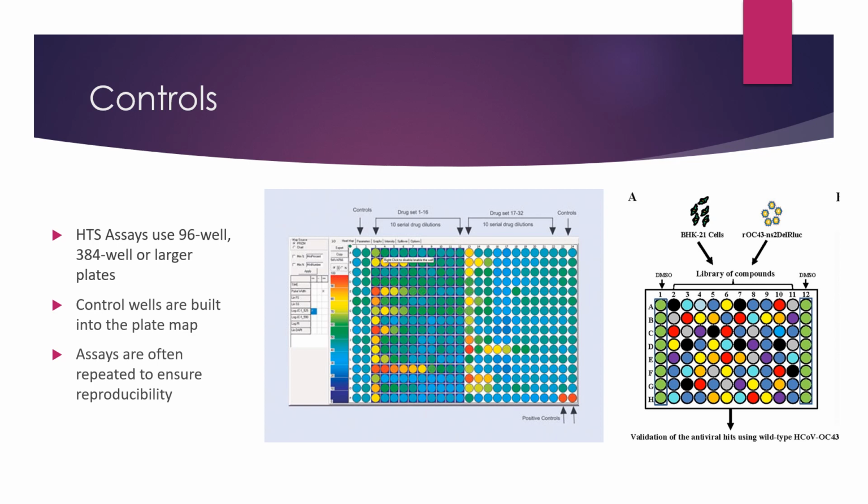The figure on the right is showing how a plate was set up for screening anti-HCoV OC43 compounds. This paper was looking at high throughput screening and identification of potent broad spectrum inhibitors of coronaviruses.